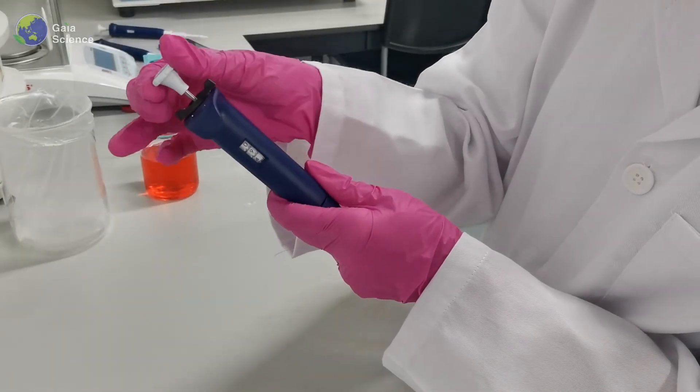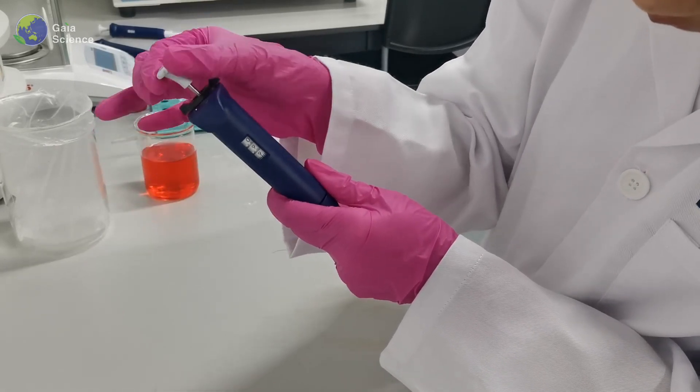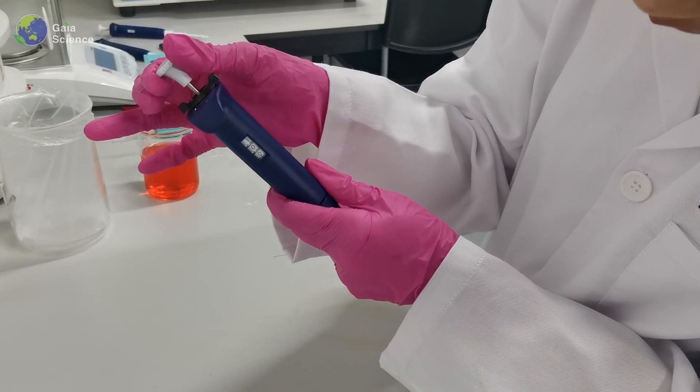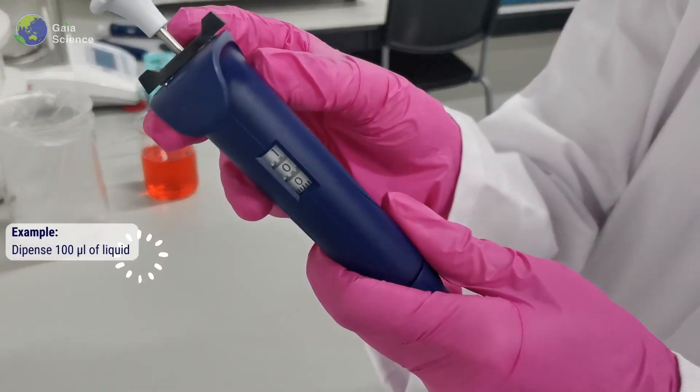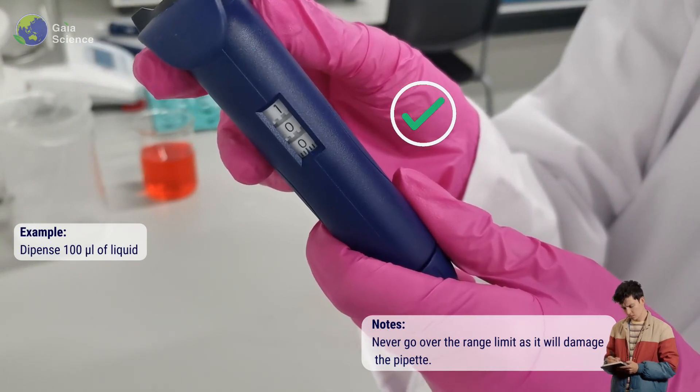Set your desired volume by turning the plunger. The volume set can be viewed on the digital display window. Never go over the range limit as it will damage your pipet.